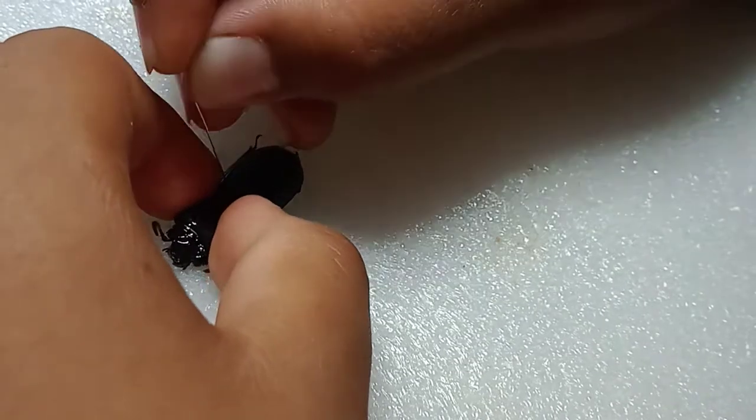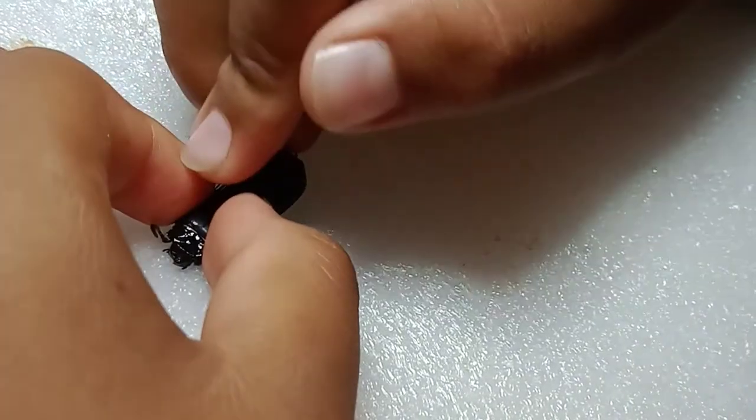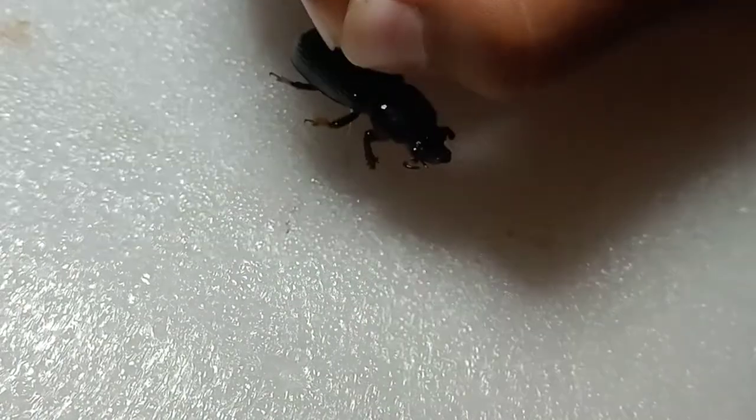Let's get to pinning. You're going to want to grab your beetle and insert a number 2 pin — number 2 or number 3, either one will do fine. Let's see if I can get it through. Once it's through, make sure it's all straight. It looks pretty straight to me.